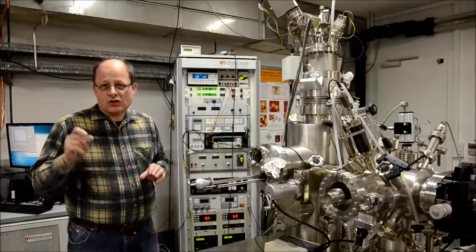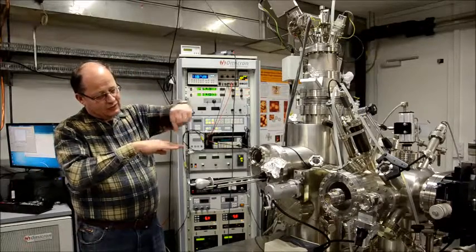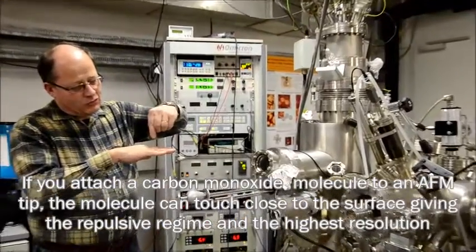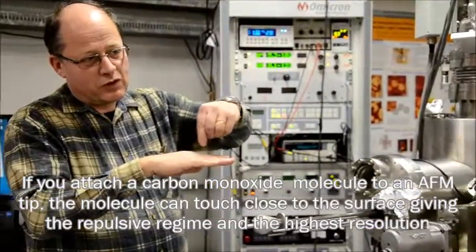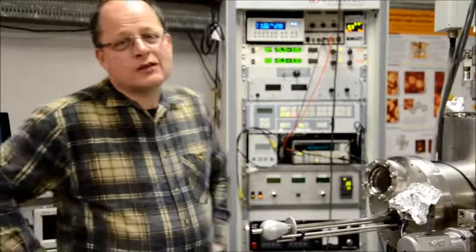So you attach a CO molecule to the tip, so the tip is scanning the surface, and the CO can approach the surface very closely and get into the repulsive regime. And by that you can basically get the highest resolution.